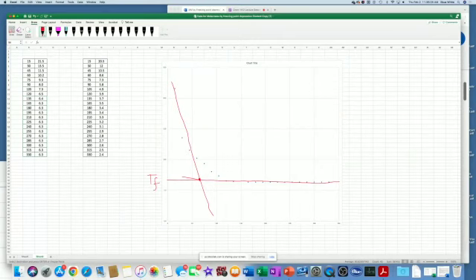It's just the person did it on video. It was so cool. I'm like, oh, I want to do that. Then I couldn't do it. So can you all see that? That's the freezing point for the first graph. So you do it for both graphs, and then I guess it works out. This is so much easier. My goodness. I mean, there's a proper way to do it, Excel stuff, but y'all saw me just fall apart.